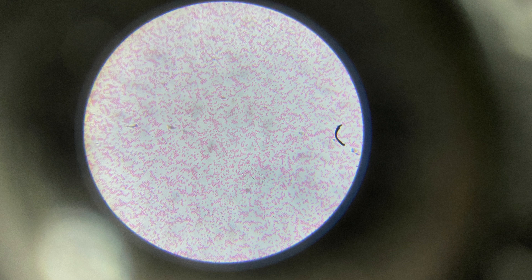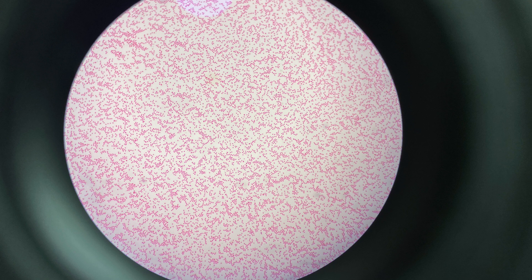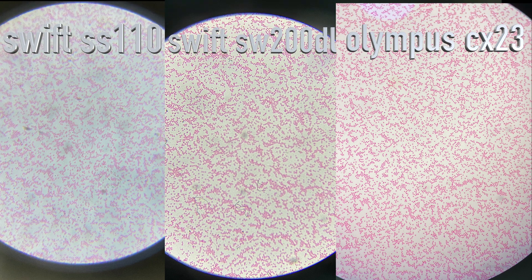This is a sample of red blood cells from the Swift SS110 microscope. You can clearly see the red blood cells, but the image is a little bit fuzzy with some chromatic aberration on the edges. Now, looking at the image from the more expensive Swift microscope, the image is a lot clearer with less chromatic aberration, but still a little bit fuzzy on the sides. The Olympus microscope, however, removes all that chromatic aberration — the blue fringing around the edges. The image is sharp to the edge, wider so you can see more red blood cells, and it's brighter and more natural looking. Comparing the three side by side, you can see that the more expensive the microscope, the better the image — though both Swift microscopes are quite good.